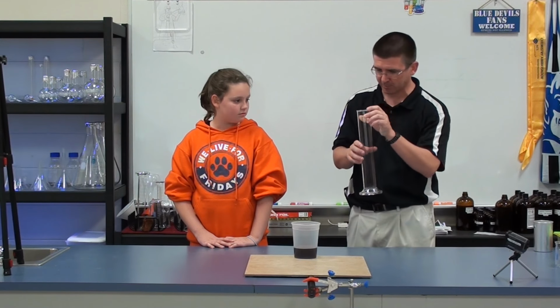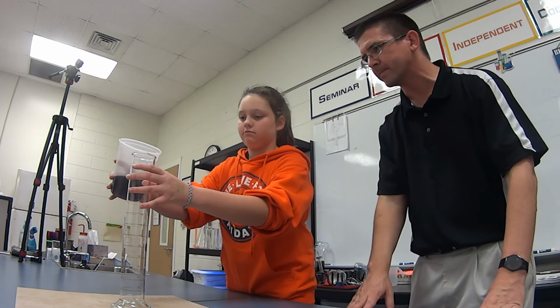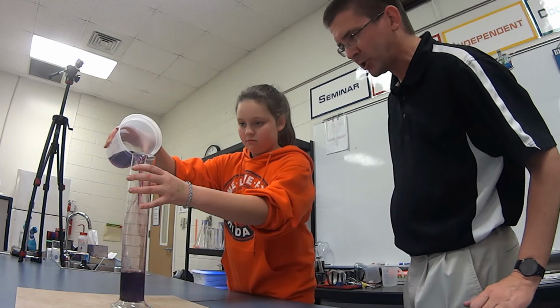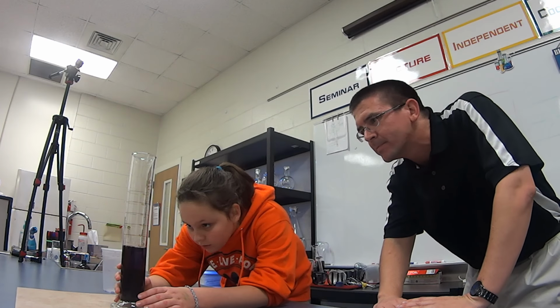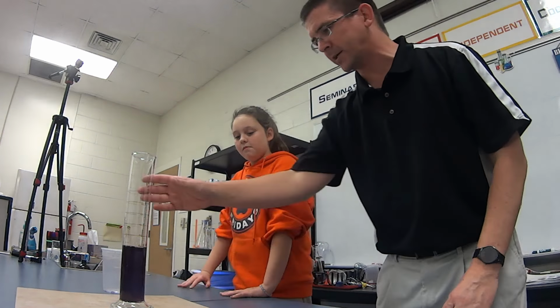And you've done this in class. I'm just going to let you go ahead, use that graduated cylinder there, and tell us the volume of that liquid. The graduated cylinder has lines on it called graduations, and we can use those to know the measurement. So what do we have there? 250 milliliters. Okay, so we got 250 milliliters of purple liquid, right?